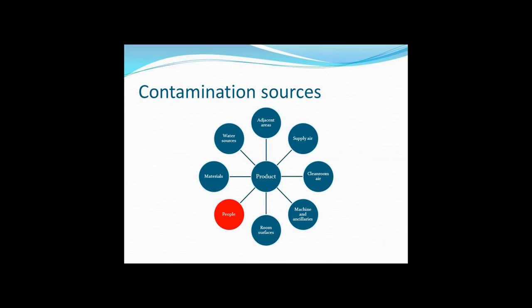Then there are surfaces, and here contamination transfer is key. So it's possible to transfer contamination from a less clean surface to a clean one. And there are different contamination control metrics that can be looked at, and here Tim Eaton has done some very interesting work, and that's well worth looking up if that's an area of interest to you.